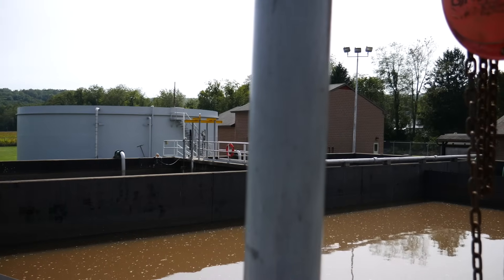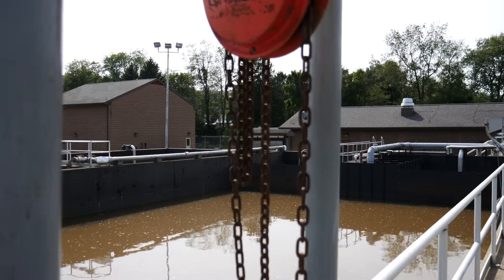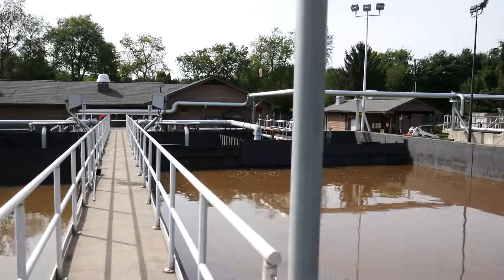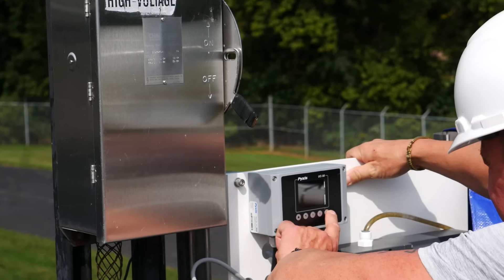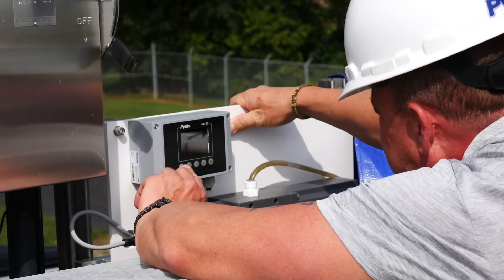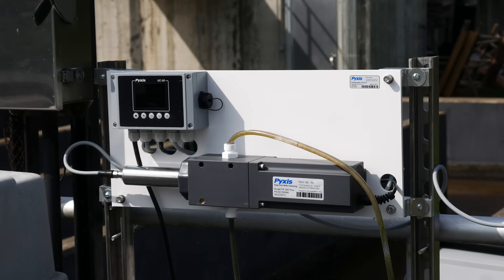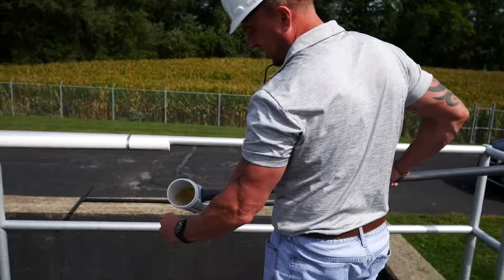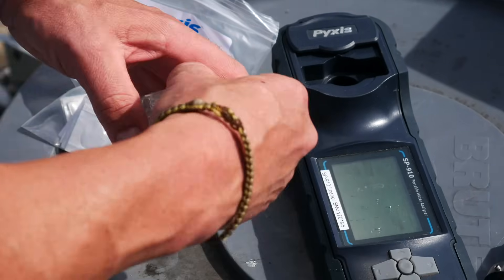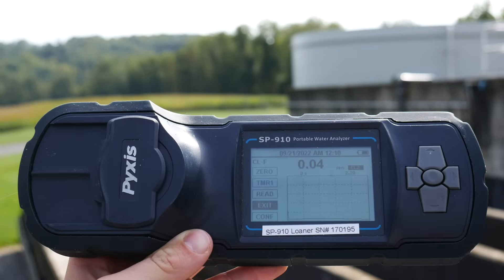It's a tertiary water treatment plant and the application here in particular is utilizing the new OxyPanel for industrial application, where we're monitoring the free residual chlorine value as well as the pH value. The goal is to see nothing — this monitor is installed downstream of sulfite addition for dechlorination, and because it's a direct discharge application, the facility is permitted to have zero chlorine in the final effluent.